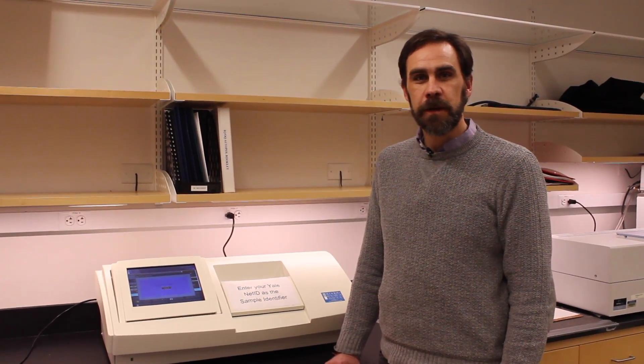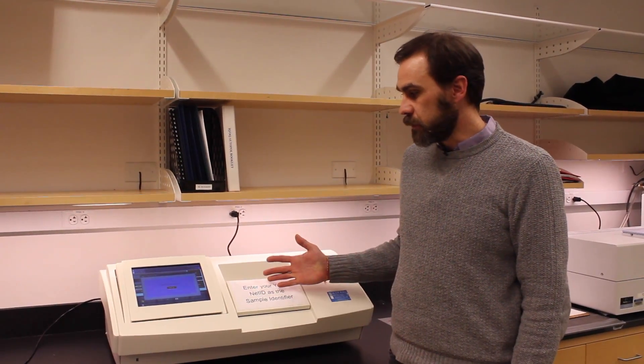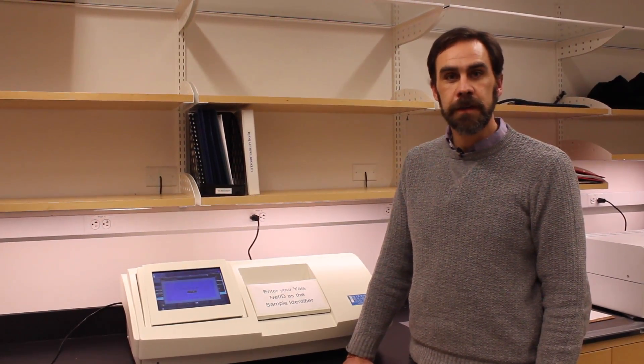Hi, I'm Eric Paulson, Director of the Yale Chemical and Biophysical Instrumentation Center, and today I'm going to show you how to use our Rudolph Polarimeter. This instrument measures the optical activity of a sample and can be useful for characterizing chiral molecules.